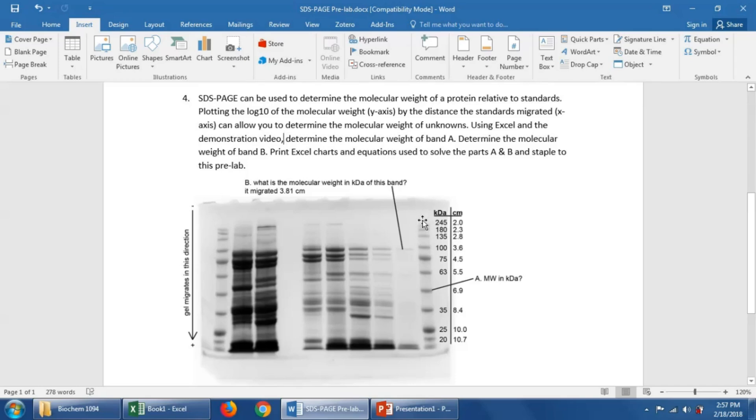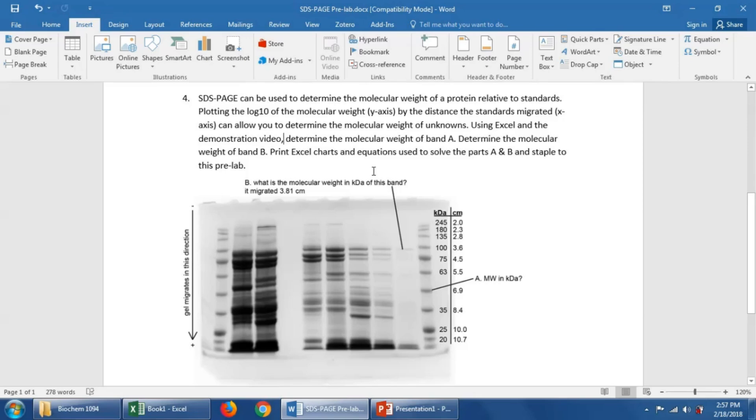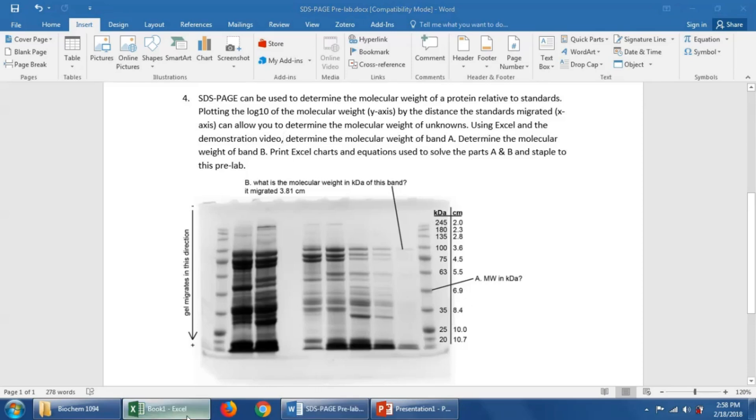In order to calculate the molecular weight of an unknown, we can plot the log10 of the molecular weight versus the distance that the standards migrated. I'm going to show you how to do this in Excel and we're going to figure out how to calculate the molecular weight of this band here at A that migrated 6.9 centimeters. Let's jump over to Excel.